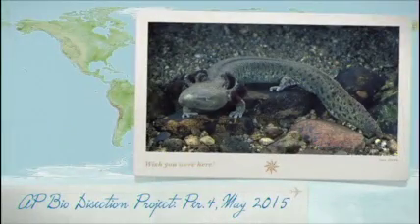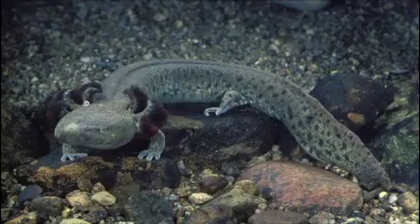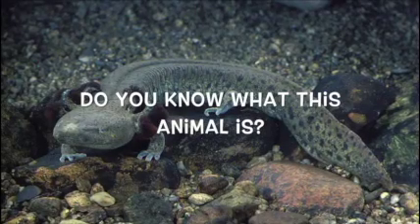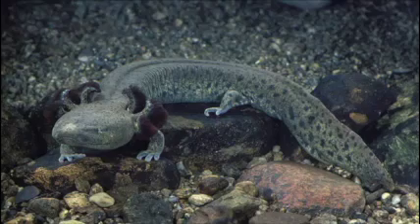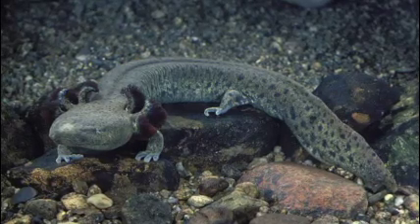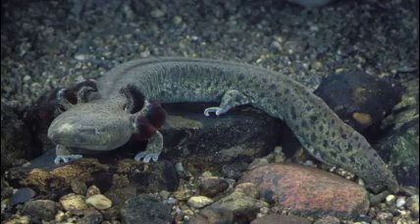This is our project. Do you know what this animal is? If you guessed Necturus or mud puppies, then you are correct.